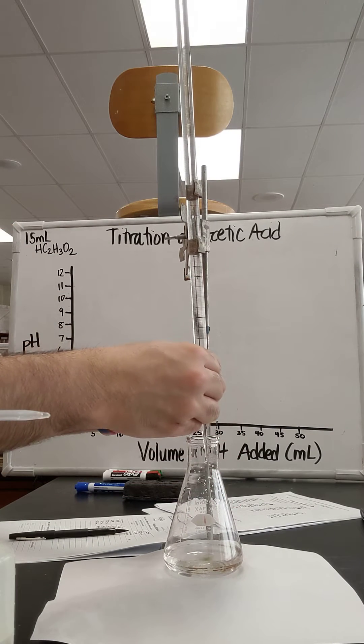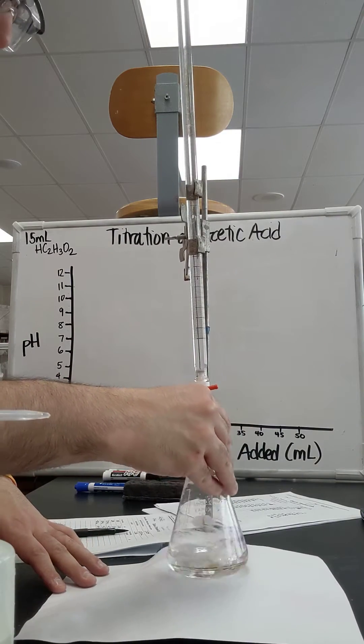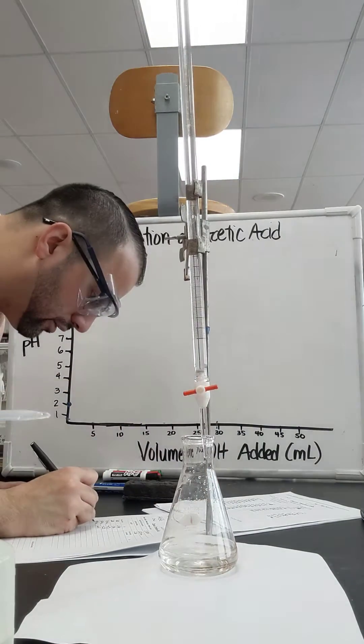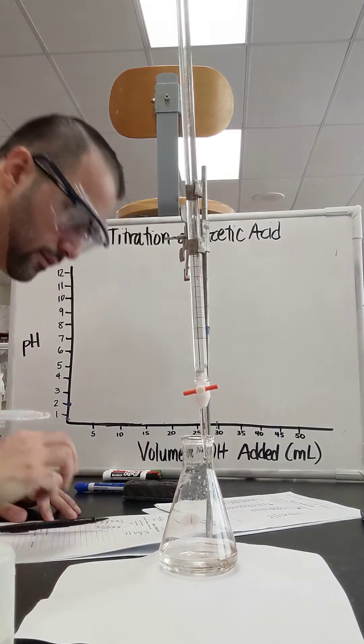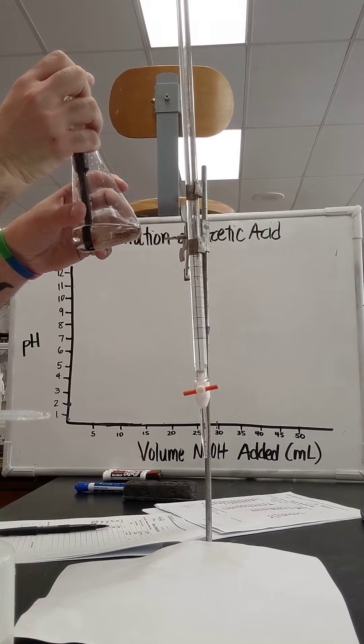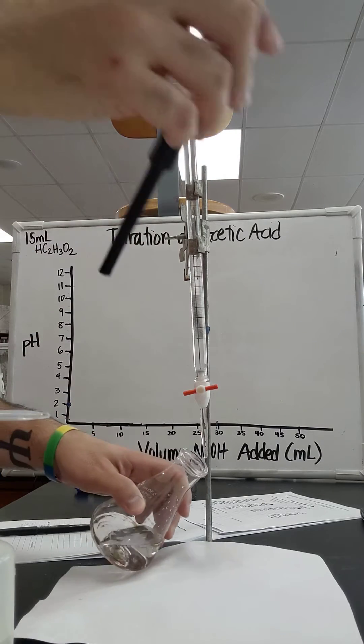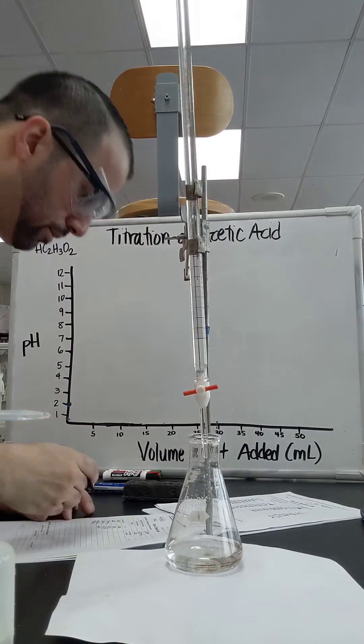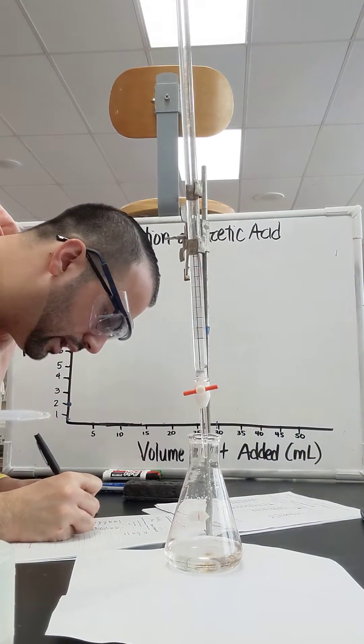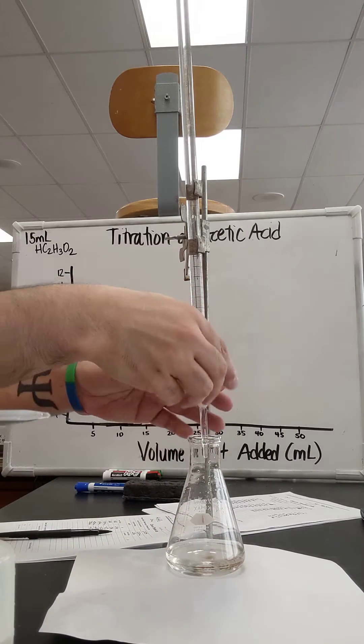I'm going to drop another milliliter. I got to 5 milliliters, got a dark color. And my pH is looking like 4.57. Kind of a steady pH here. We're going to call this the buffer region later. I'm going to drop another milliliter in there. I got 6 milliliters.